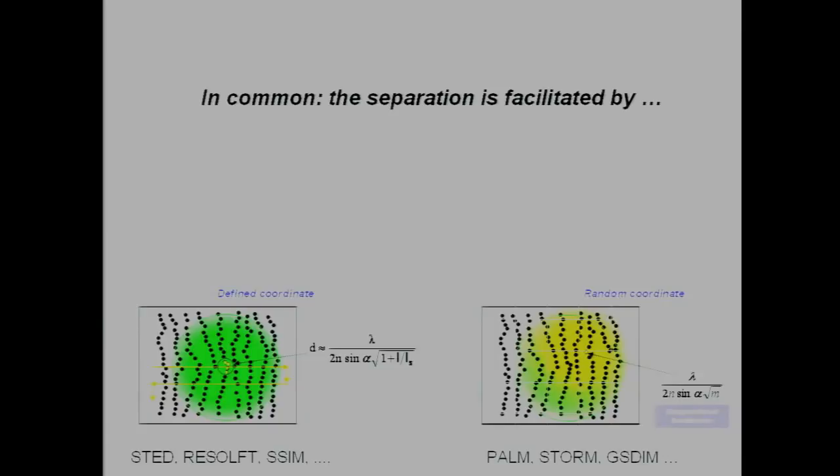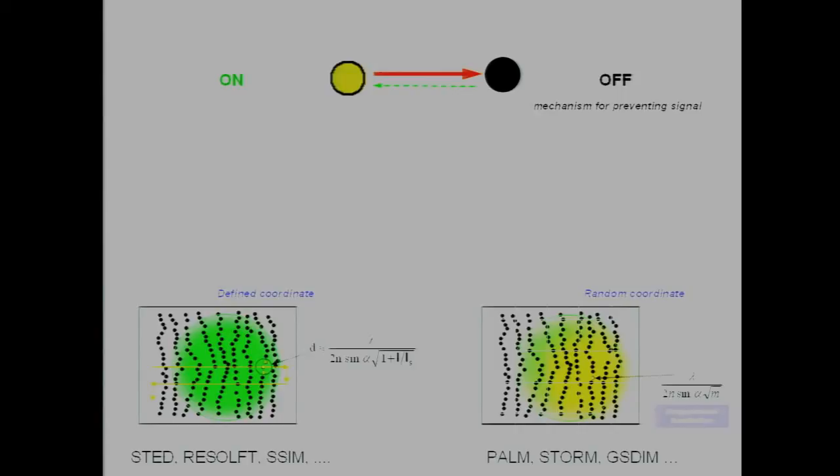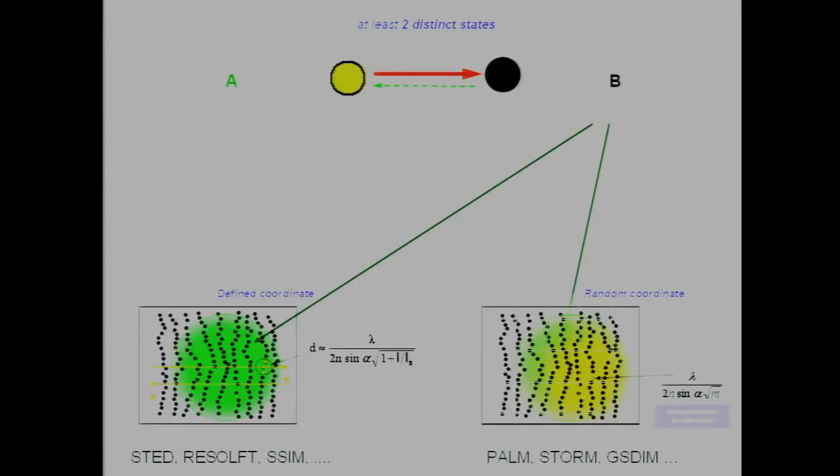And this is done by using an on-off transition. So make sure that not all the molecules within this critical range of 200 nanometers are capable of emitting. Just a fraction of them, or only one of them. And this allows us to tell them apart. So off means that there must be some sort of inhibition that prevents the molecule from emitting in both cases, despite the fact that it's flooded with excitation light. Now, what is the mechanism for inhibition? Well, you have to put it in a state in which it's not capable of emitting. So to be more general than on-off, it means we have two distinguishable states, a state A and a state B. Once you have separated your molecules and have them transiently in two different states, you can take things apart. And then once you realize that, you say, oh, does this need to be fluorescence?